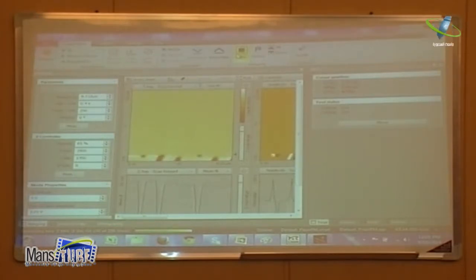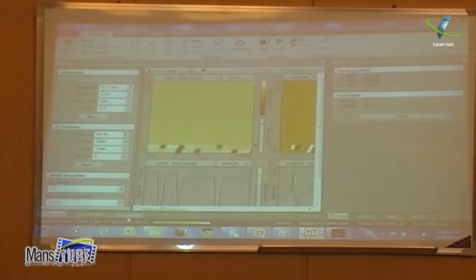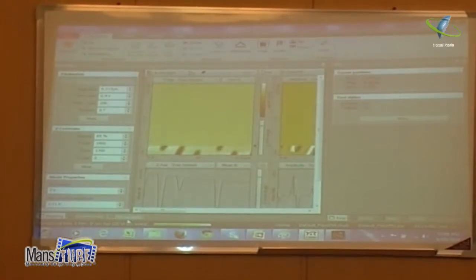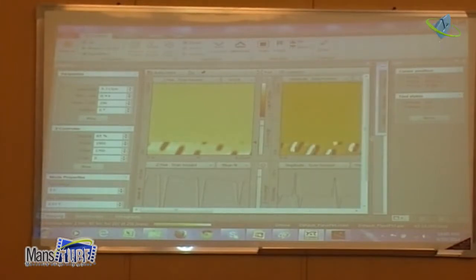In principle, we should do it all at the same time. Wait a minute, it should be now. It's here.